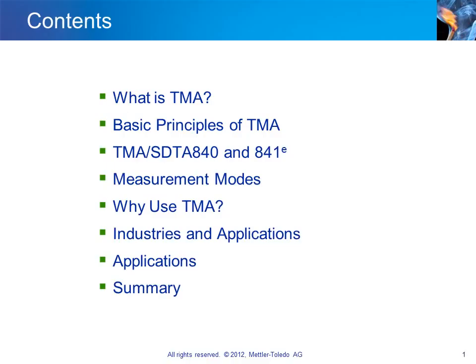In this seminar, I would like to explain the basic principles of thermomechanical analysis and at the same time introduce two high-performance TMA instruments. I also want to point out a number of important design features and benefits and discuss the different sample measurement modes. Finally, I will present examples to illustrate the different application possibilities of TMA in various industries.